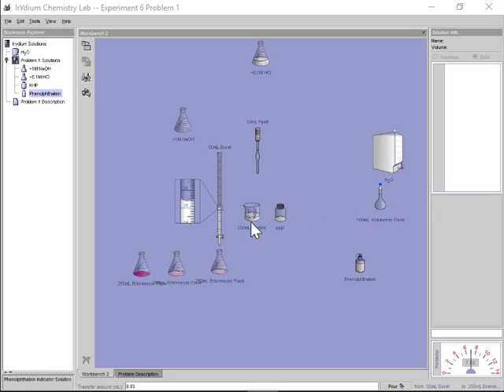Again, the reason why we pre-make the solution in a beaker is because a beaker has a much wider mouth, and it's a lot easier to take a stir stick and mash up the powder. Although the volumetric flask is nice and quantitative, really well calibrated for 100.00, that narrow neck makes it really hard to dissolve powder inside. After you're guaranteed that it's 100, we poured it back into the beaker. It's okay that it doesn't line up with the 100 mL beaker marking, because I'm already confident that it's 100.